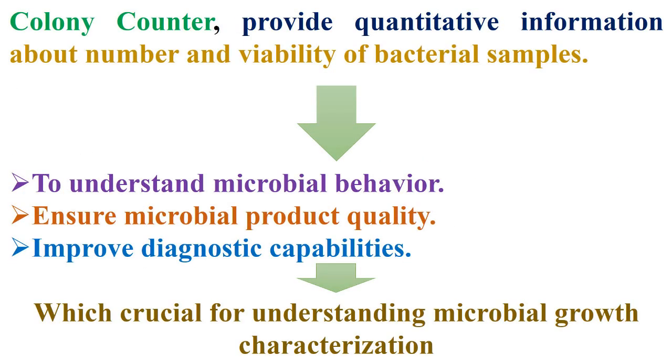Therefore, the colony counter provides quantitative information about the number and viability of bacterial samples, to understand microbial behavior, ensure microbial product quality, and improve diagnostic capabilities, which is crucial for understanding microbial growth characterization.